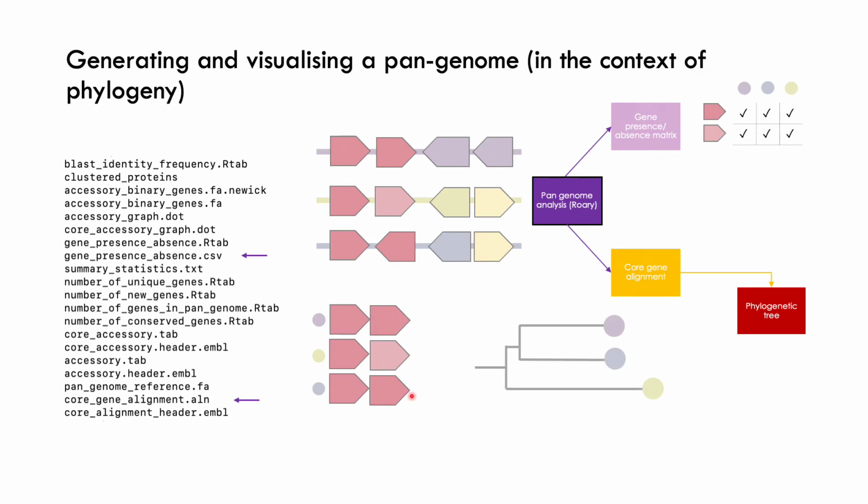So we take our alignment and we plug it into tree building software. One that I mentioned earlier on is called IQ-Tree. I included the little icon. And so what we see based on the sequences is that the purple and blue ones, based on the core gene sequences, are very highly similar.